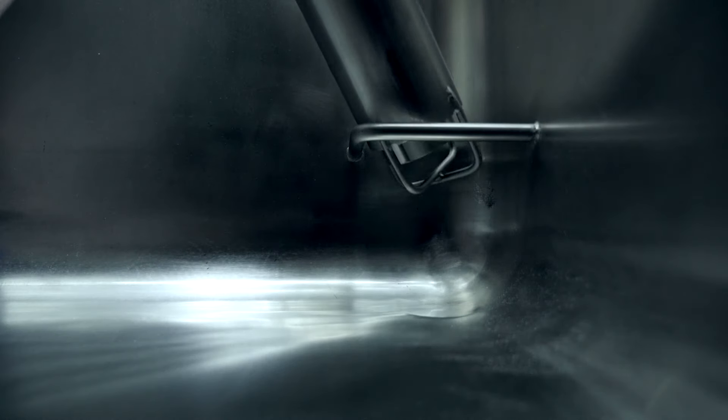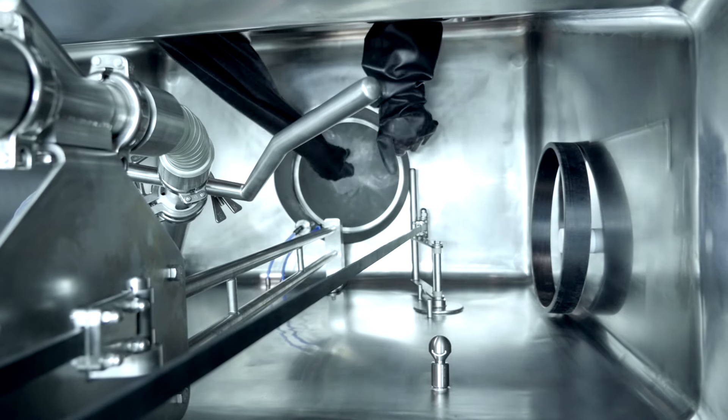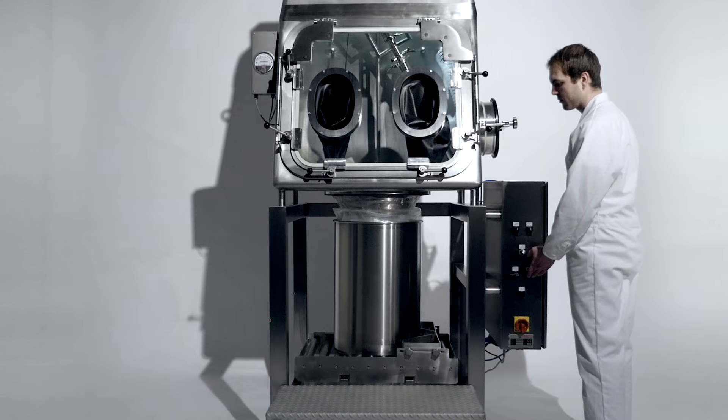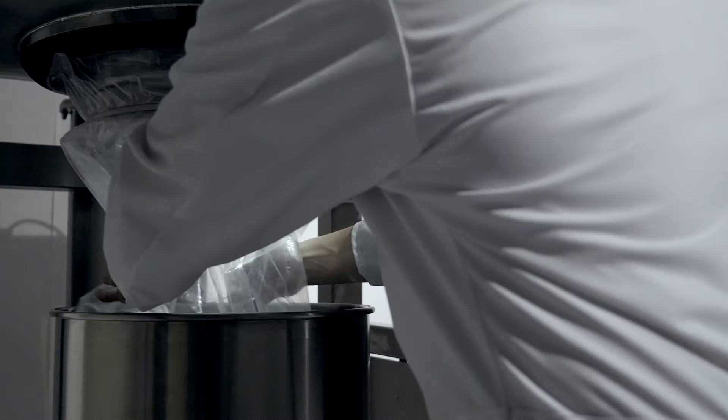After completion of the discharging process, the inflatable seal and the counter ring can be dismantled. Afterwards, the empty inner liner can be closed and put back into the drum. In order to ensure the containment, the disconnection of the outer liner is performed with the Hecht High Containment Closing System.